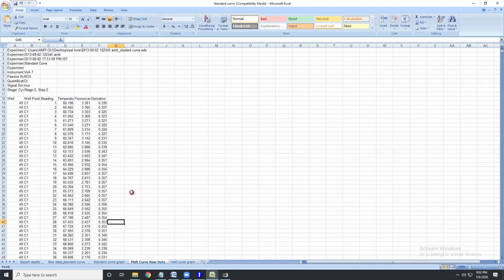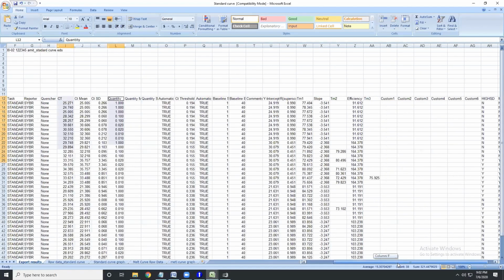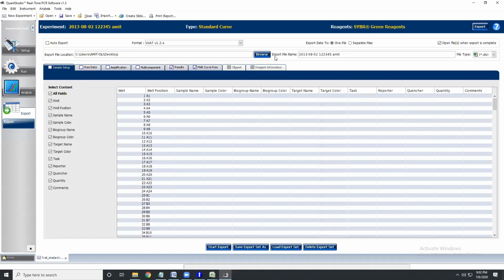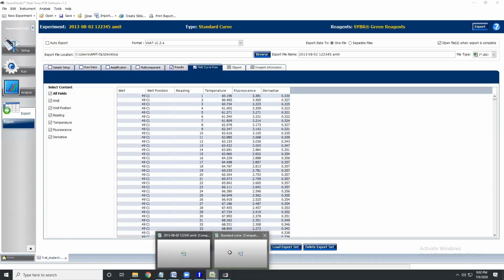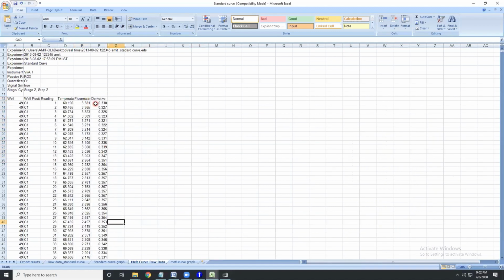Similarly, for the melt curve graph, in the export value, I don't know if I have copied here, but similar to that, if you check the export option of this particular table, you can see that there is a possibility to take the melt curve data. So you can again copy the melt curve data, and there is one trick with it: there is a derivative value. It's a derivative value of the fluorescence.